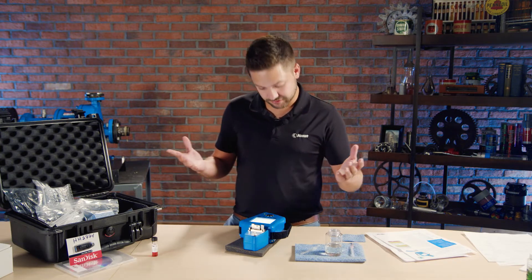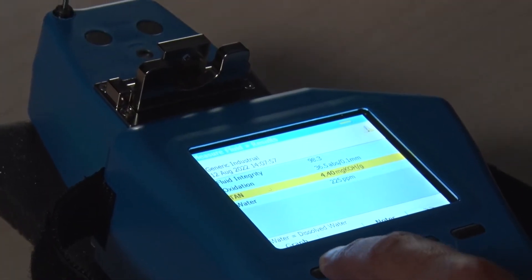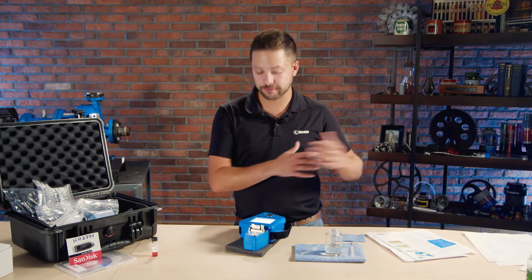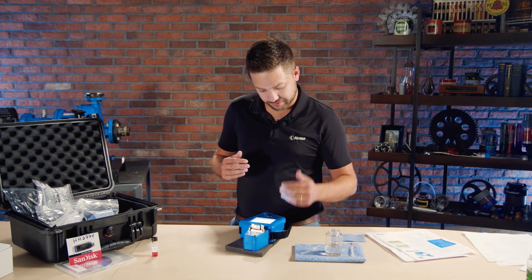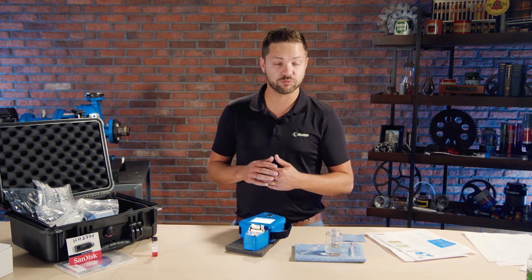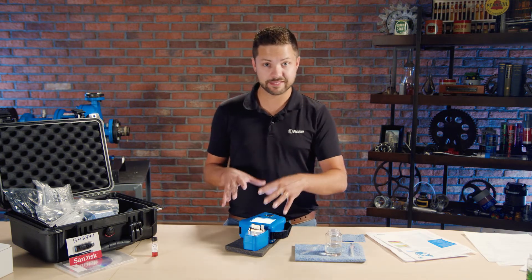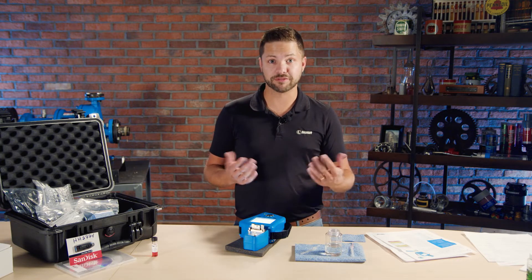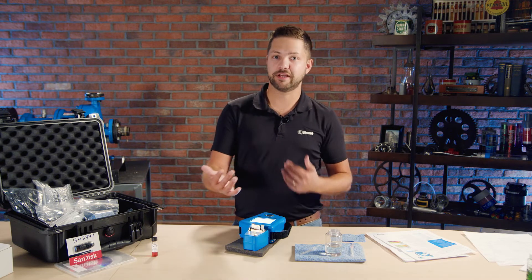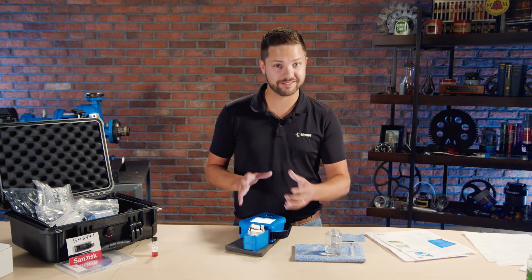So here I got the results already. It's showing me an acid number — that's one thing I forgot to mention: total acid number. If it was an engine oil, it would test for the total base number. So here we have an acid number showing water, oxidation level, and there's an overall fluid integrity. There are ways to add more values as well when I'm able to create a reference for a selected fluid in the database. They have almost 900 lubricants they're referencing. If I have that fluid, I can use it to test a whole bunch of parameters. If it's not in the system, that's okay — you can add it in the system pretty easily.